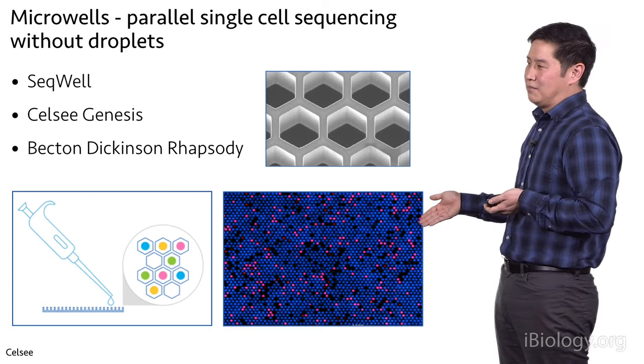in the data set. What's really cool about this method is that if you have a doublet, 2 cells in a single droplet, and you have 8 different samples, chances are those 2 cells came from different samples and they'll have 2 different genotypes. So if you analyze the data within those cells and see the presence of 2 different genotypes, you know that's a doublet, and we can remove those from analysis. So this allows you to bump up that concentration and get more single-cell data for the same cost. If you're not working with genetically distinct individuals, this method won't work.